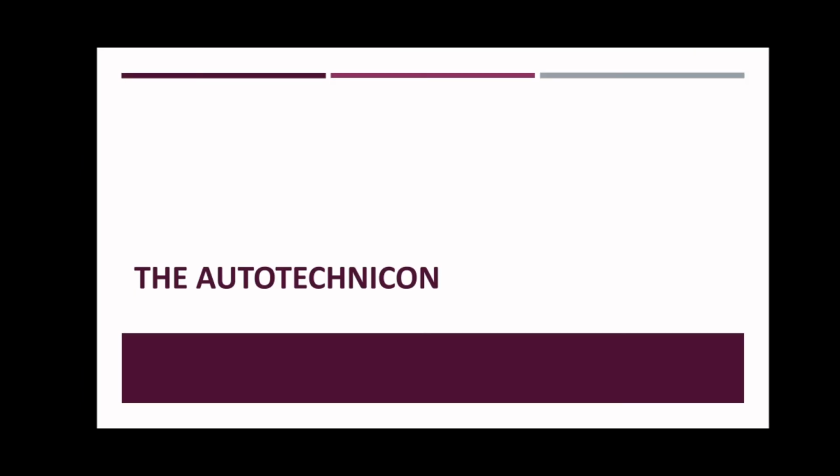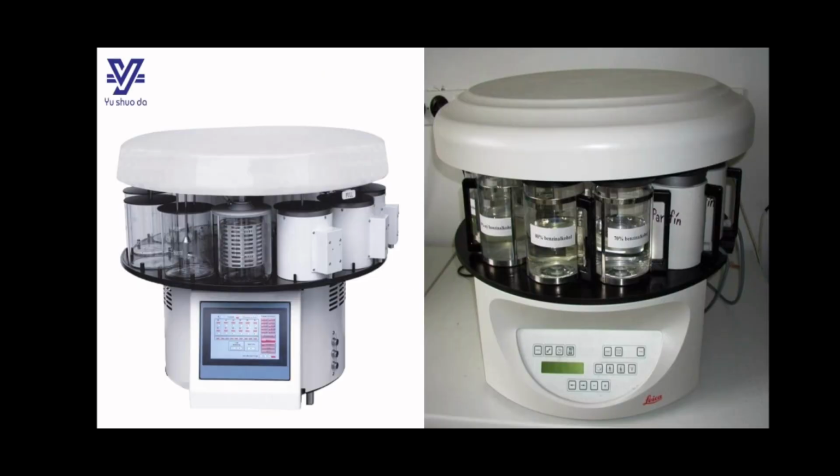The video shown a while ago is what we call the Autotechnicon. An Autotechnicon is an automatic tissue processing machine that fixes, dehydrates, clears, and infiltrates tissues, thereby decreasing the time and labor needed during the processing of tissues, resulting in a more rapid diagnosis with lesser technicality.